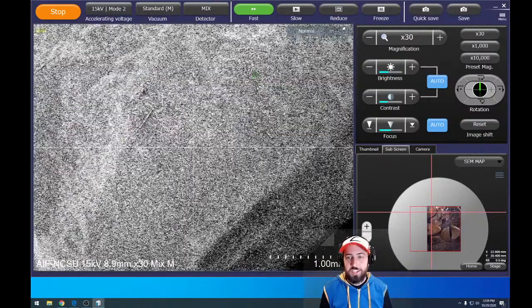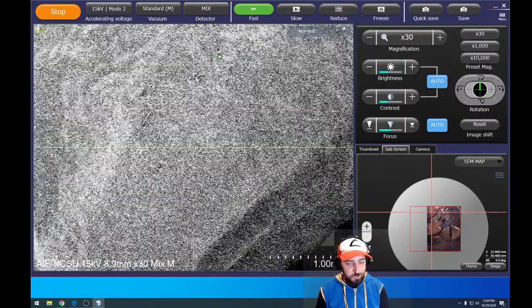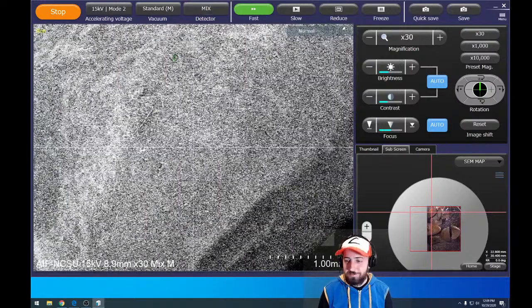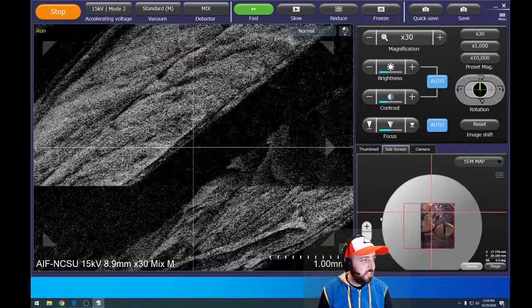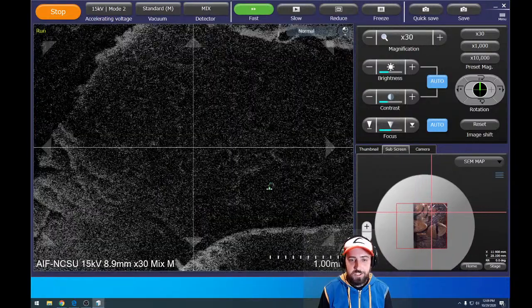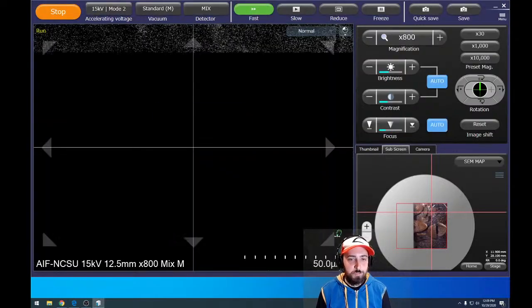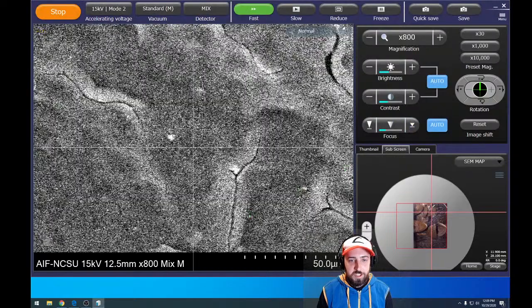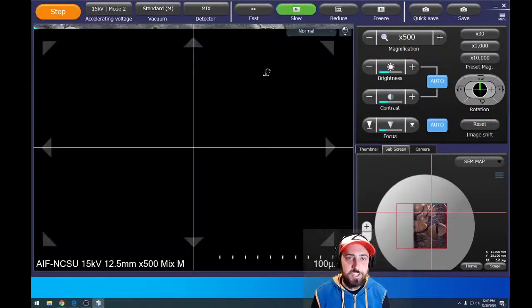And that's what we like in our pumpkins. In fact, I think we grow like 500 million pounds of those orange pumpkins per year, and we don't even eat them. They're all for decoration. So let's go look at that bright orange color, which we saw in the optical microscope, but we will not see color in the SEM because electrons don't have color. We'll go to about this magnification and start scanning really slowly.